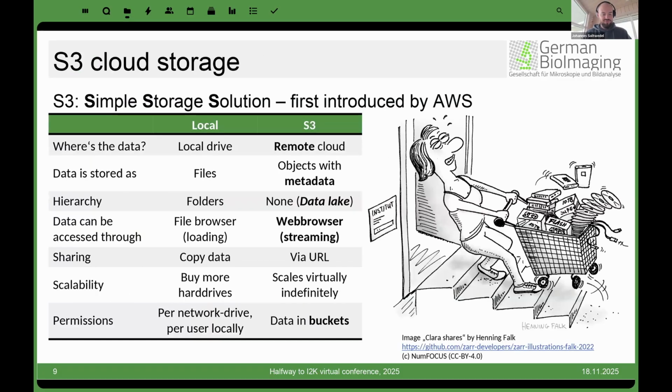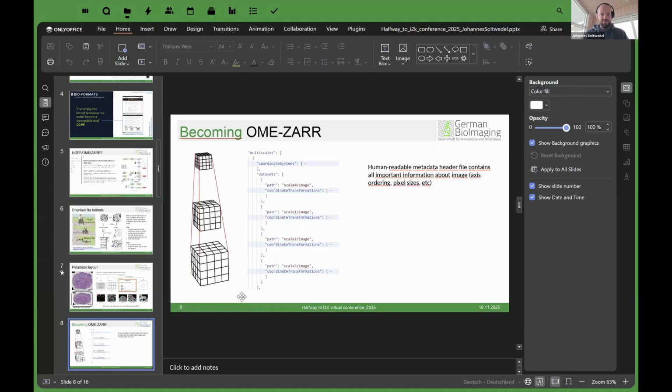And before we dive into S3 stuff, I'm going to stop sharing here and ask you to jump into the notebooks. I will also open the repository here. So let me minimize my browser. We're already 20 minutes in, so time for some hands-on stuff.